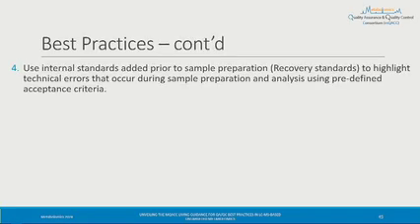And then continuing, here we also differentiate that internal standards can be added at two different parts of the workflow. We can add them pre-extraction, in which way they will monitor our extraction processes. And there we are saying if you are using them in that way, then they will highlight technical errors that occur during sample preparation and analysis, and you need to have predefined criteria whether to accept or reject your sample results.